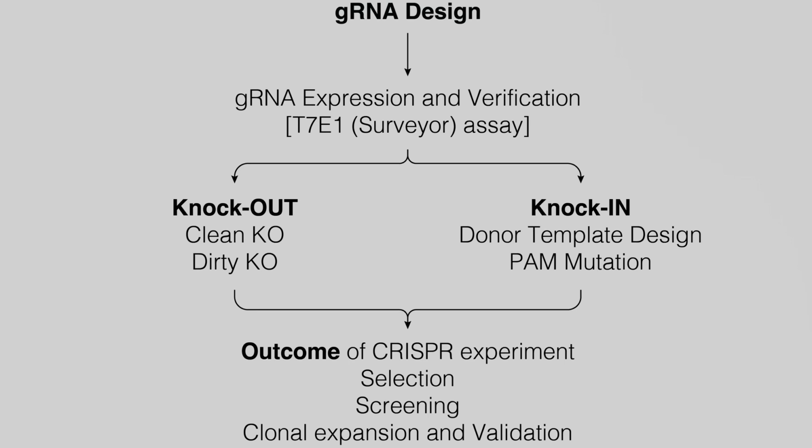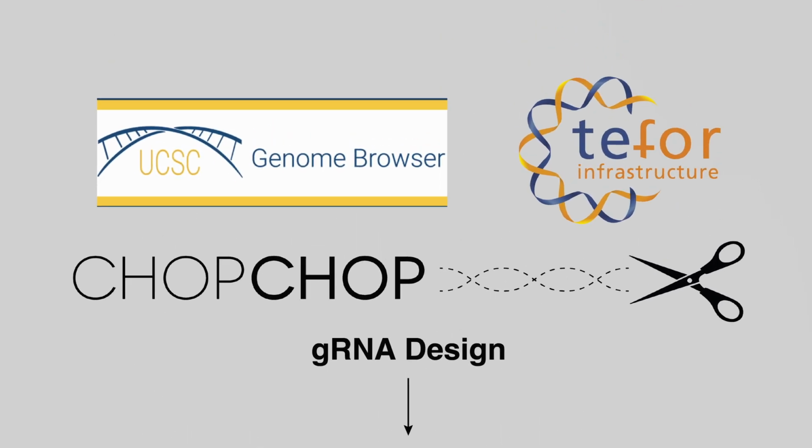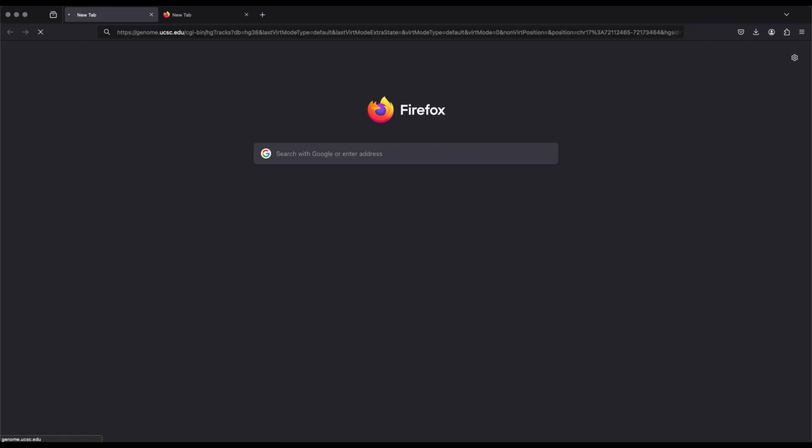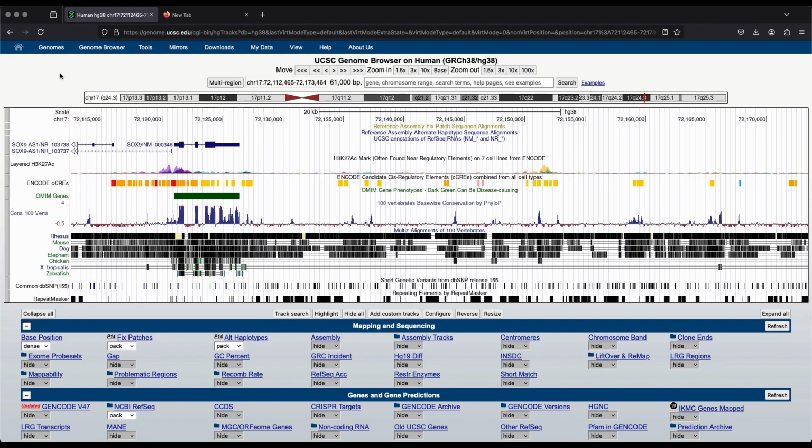Here's the simple workflow for a typical CRISPR experiment for mammalian cells. This video is about the guide RNA design using some freely available online tools. I'm going to demonstrate one type of workflow to design CRISPR guides.